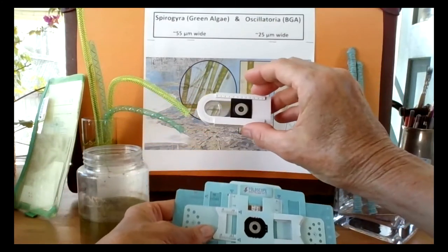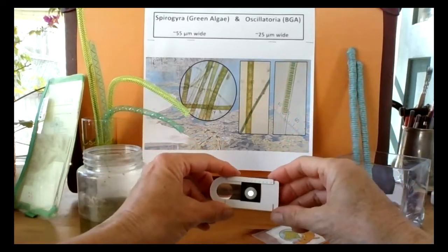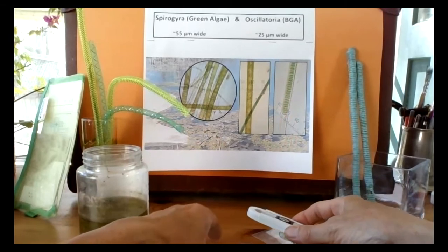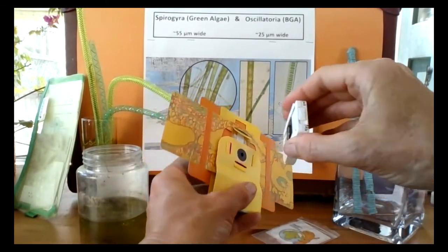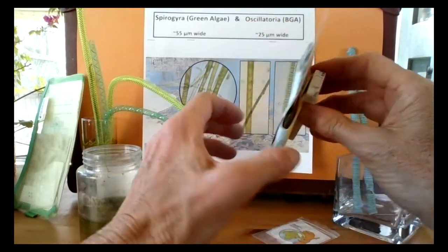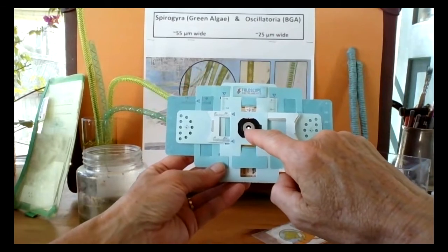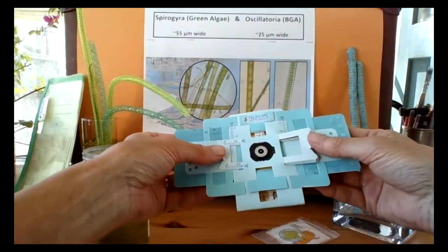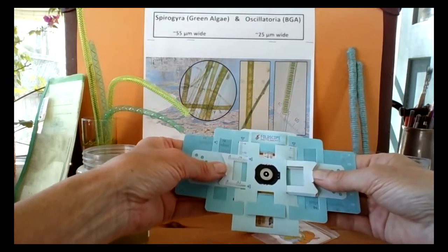Then you take your LED magnifier, which is a light source, turn on your light, put it on the bottom. The magnetic coupler will make it attach easily to the bottom. And then you can look through the eyepiece and use this focus bar to focus on your mesh.